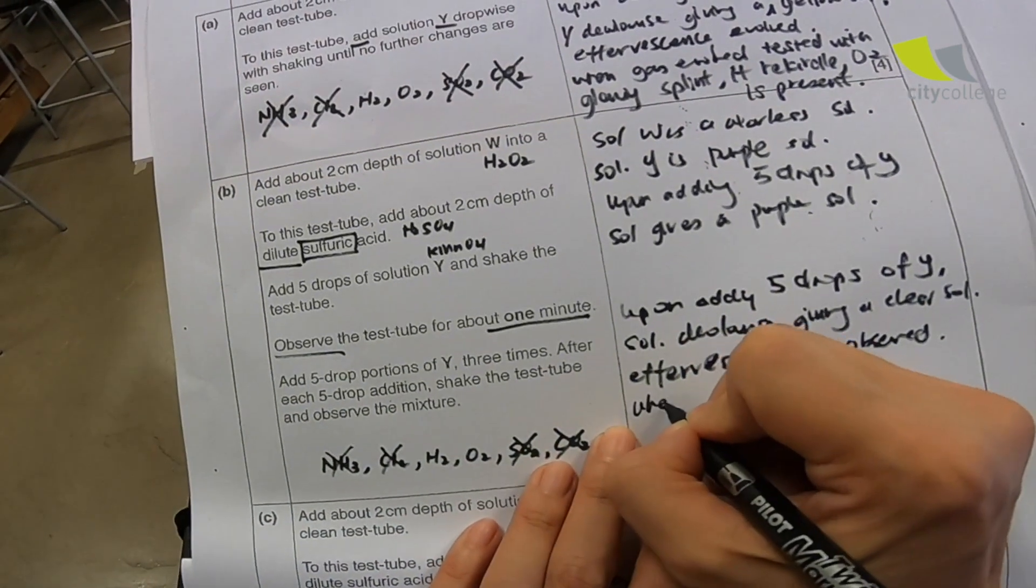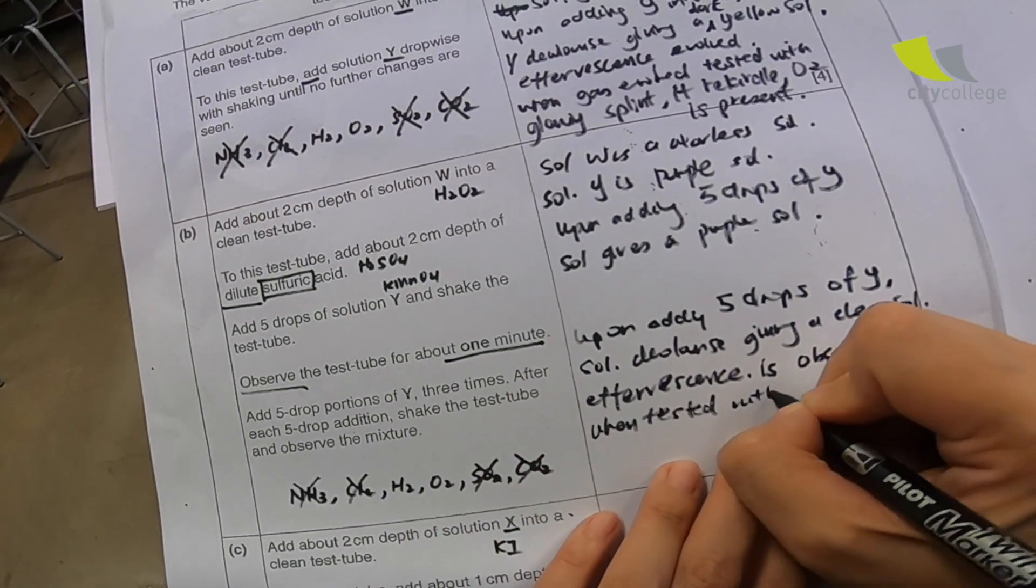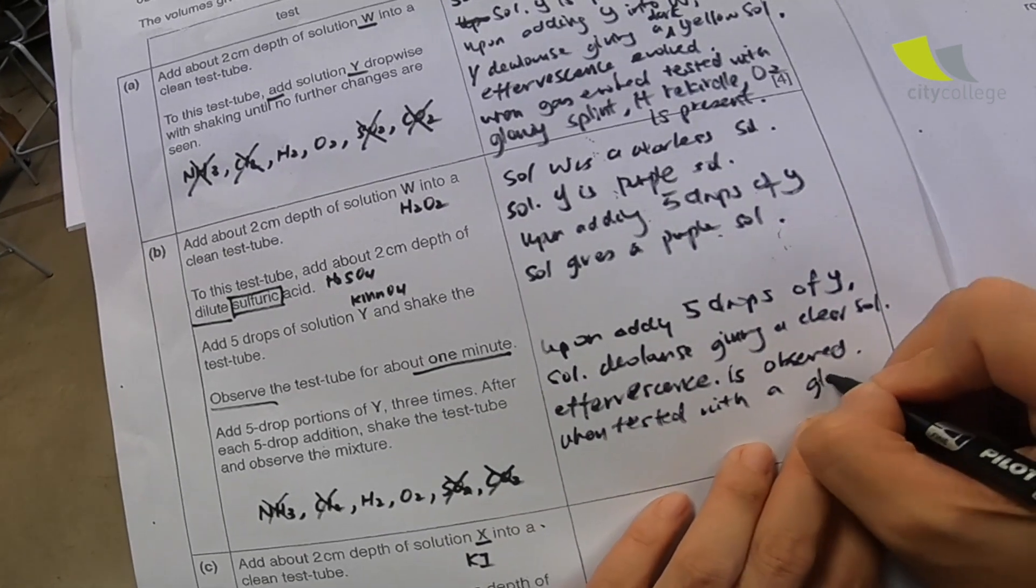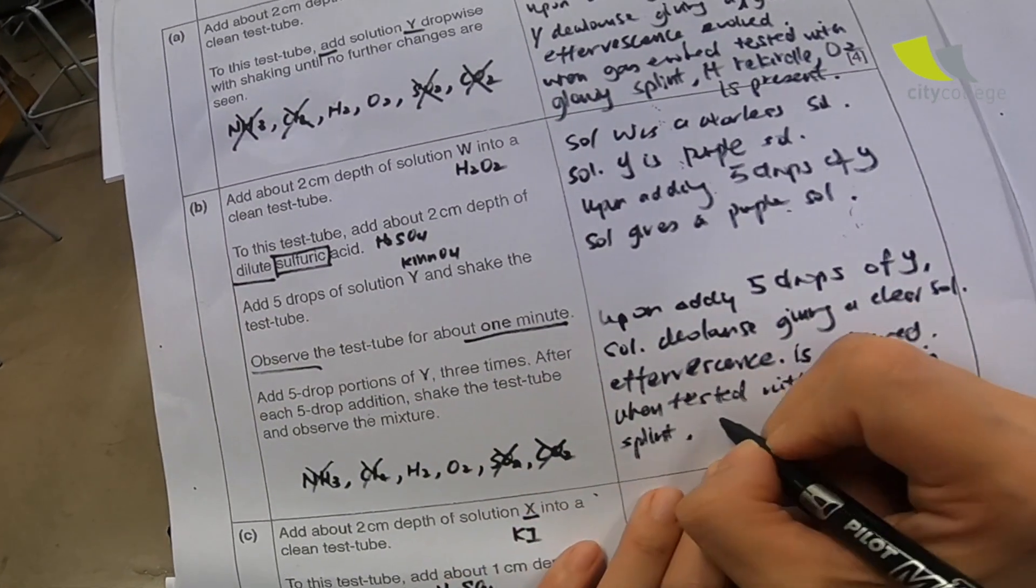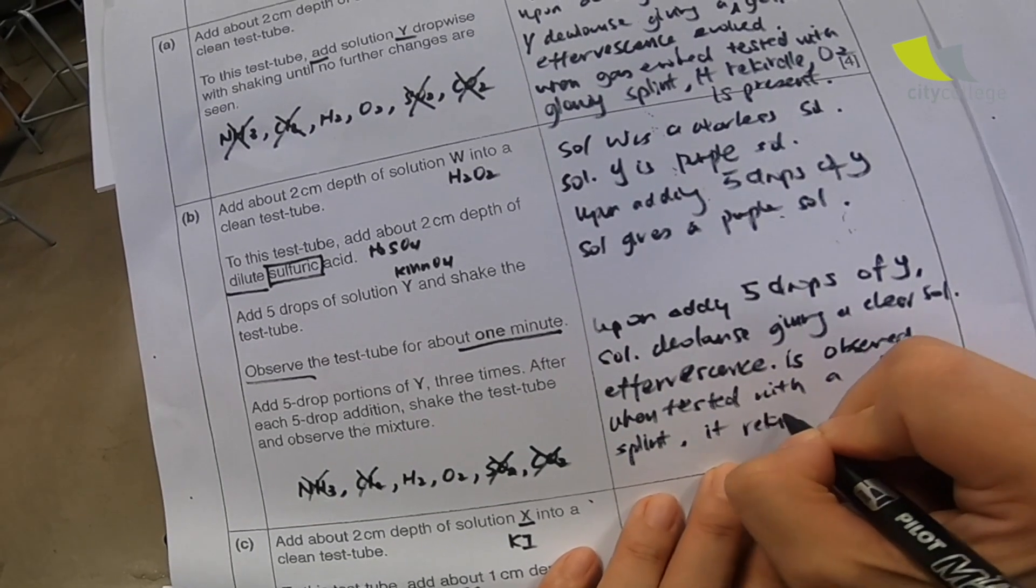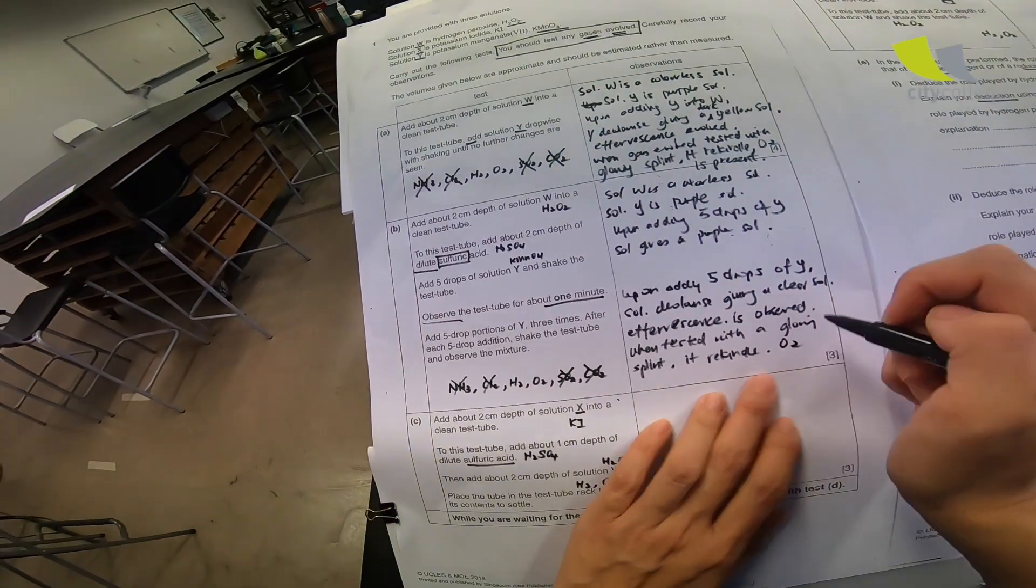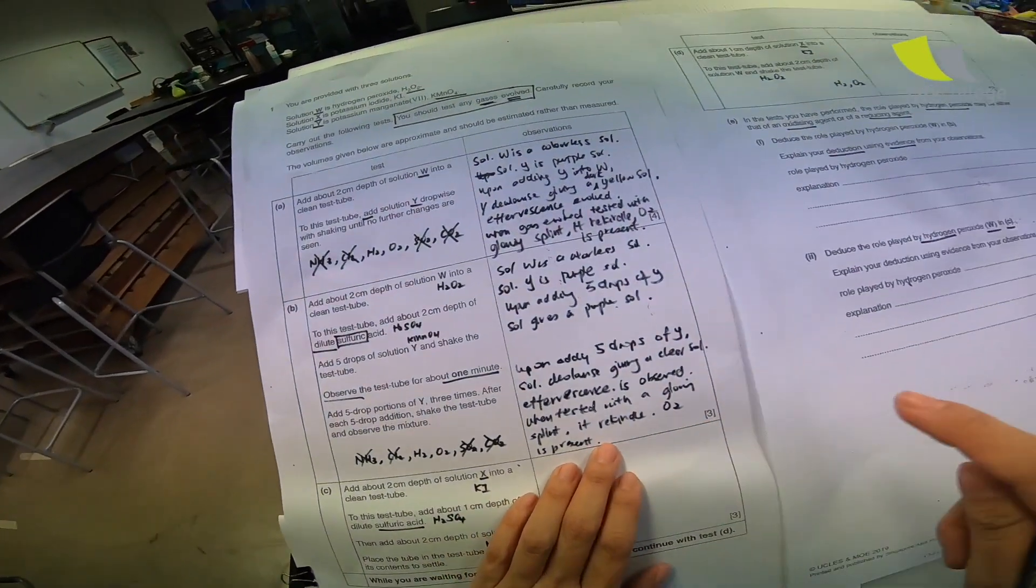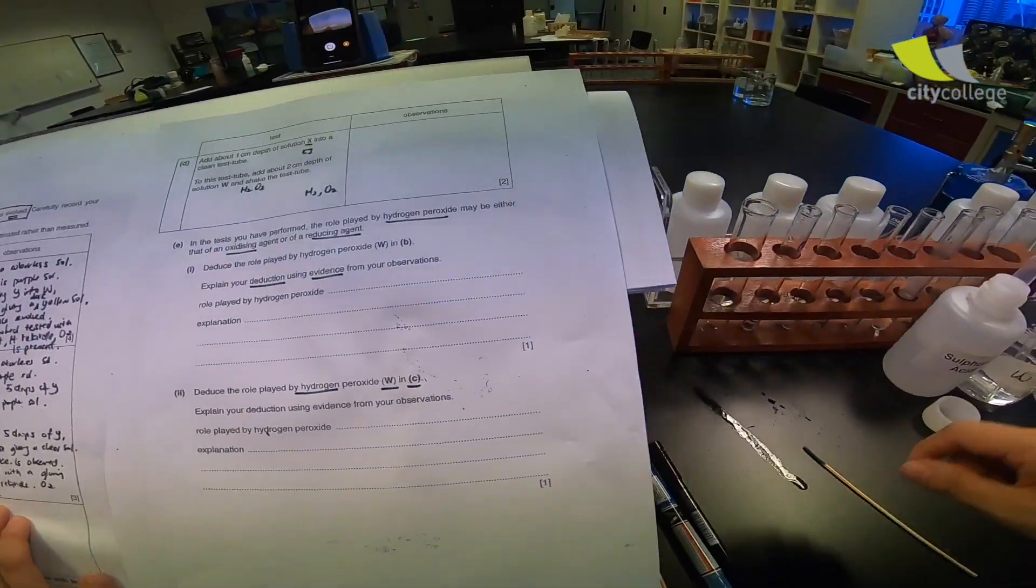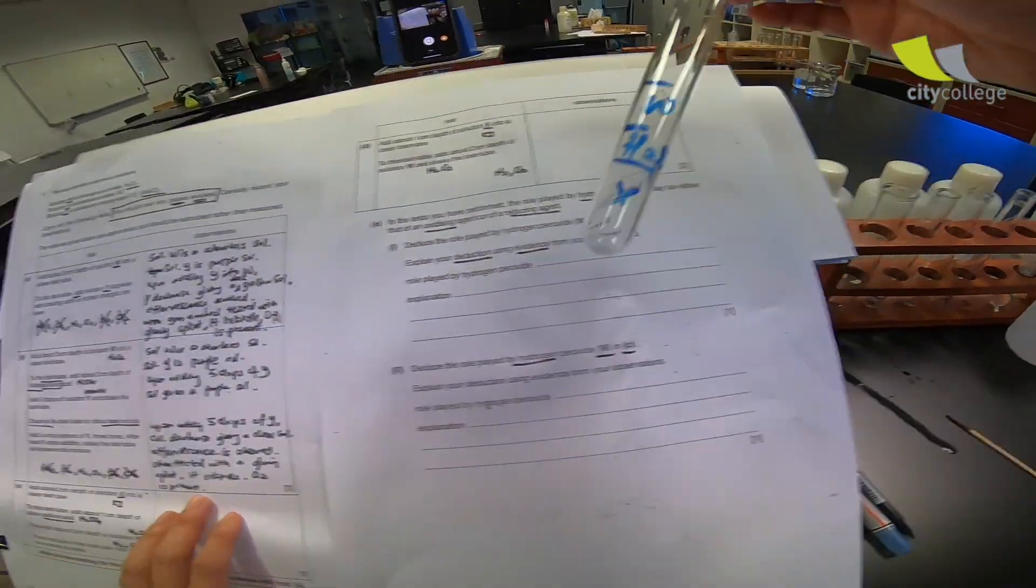When tested with a glowing splint. Some of you will be wondering. It rekindled. Now, some of you will be wondering, O2 is present. Some of you might be saying that, but just now we didn't see a result. Well, I will explain later at the end of the experiment. Let's move on to part C first.